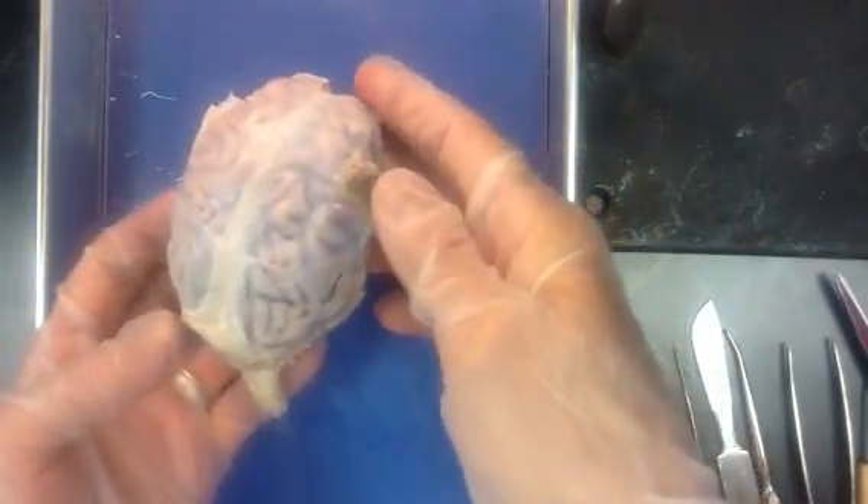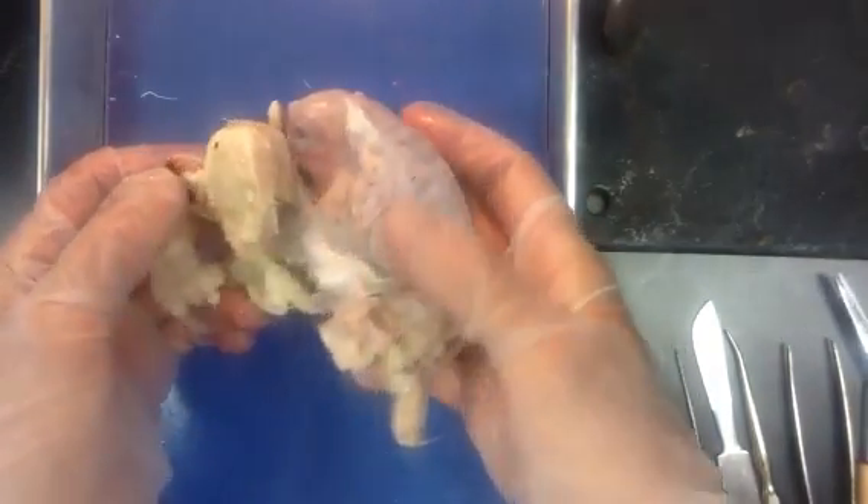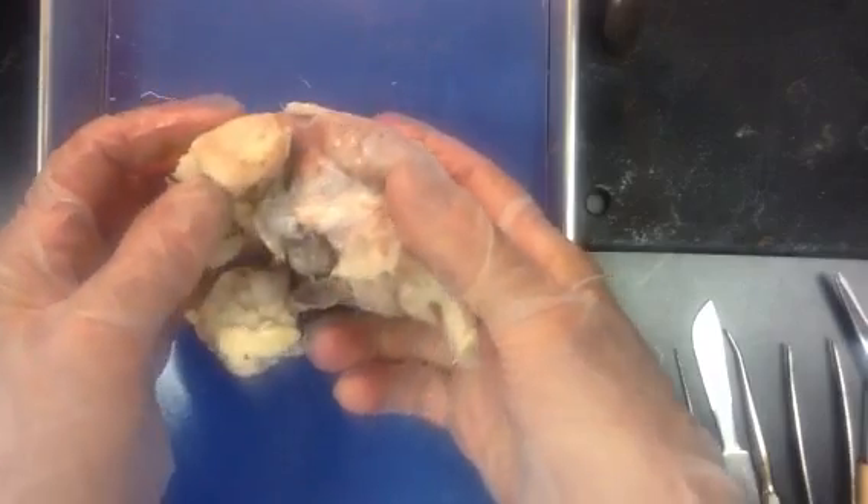The first thing we want to notice: you always want to examine your specimen externally first, and identify as many structures as you possibly can before you do any cutting.